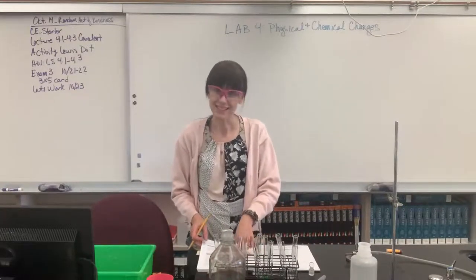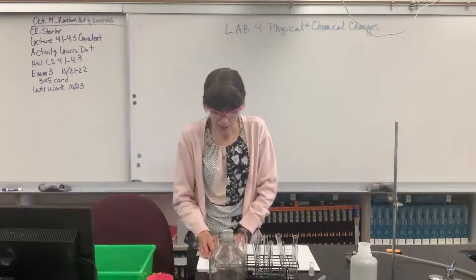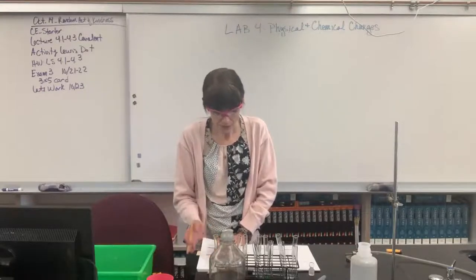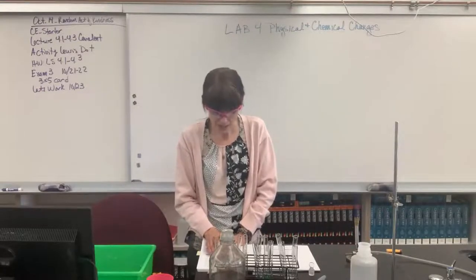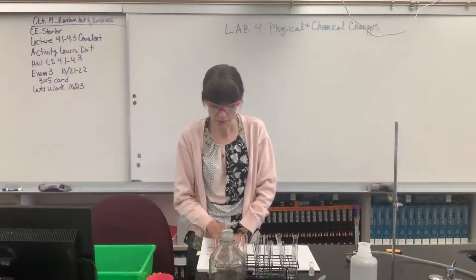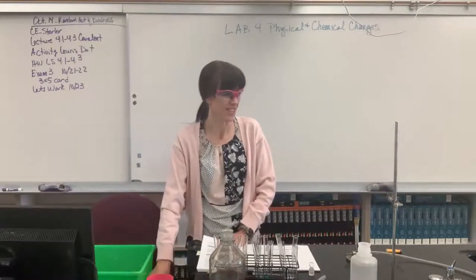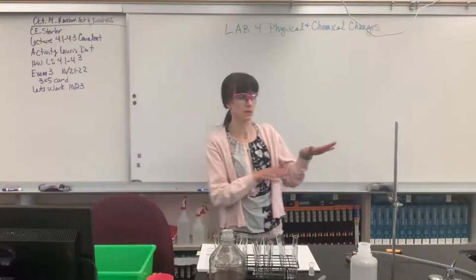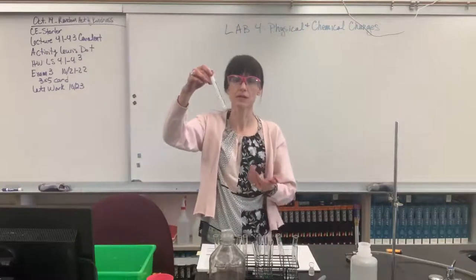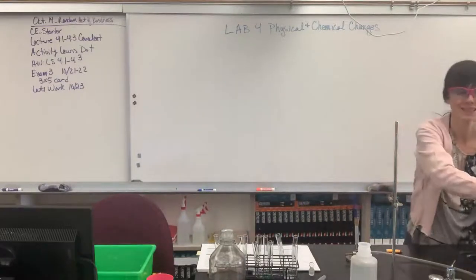So I'm on part D, step 4, and it says you will attempt to change the second sample by reacting it with hydrochloric acid. Slowly and carefully add 15 drops of dilute 6 molar hydrochloric acid to the second solid sample. No solids should remain after the reaction stops. If the solid remains, continue with 5 more drops of the HCl. Okay, so let's see what happens. My HCl, I set it away from everything else. Here's my second sample of just that white powder, my baking soda, sodium hydrogen carbonate.